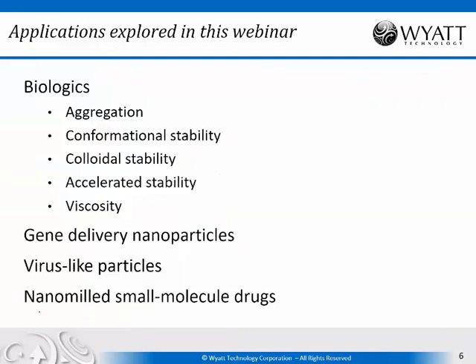So I'll begin this webinar after that brief introduction with more about the basics of dynamic light scattering and what it can measure. And then I'll go on to give a variety of applications for biotherapeutics and nanotherapeutics. For biologics, there'll be a little bit more, covering aggregation and stability, viscosity as well. And in terms of nanoparticles, a range going from gene-delivery nanoparticles through virus-like particles and to small molecule therapeutics, which are milled into nanoparticles as well, and we'll see how a dynamic light scattering plate reader can help accomplish high throughput process development.